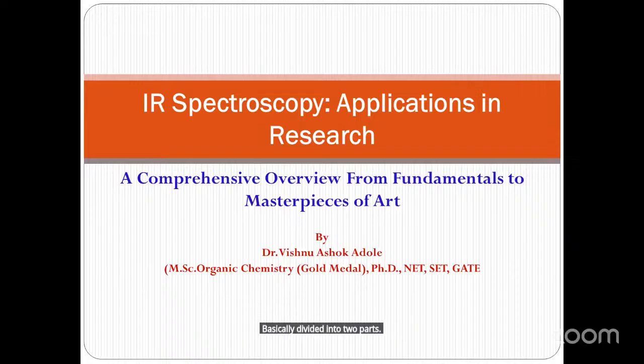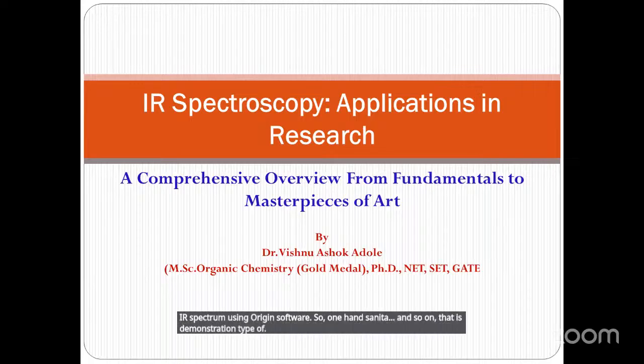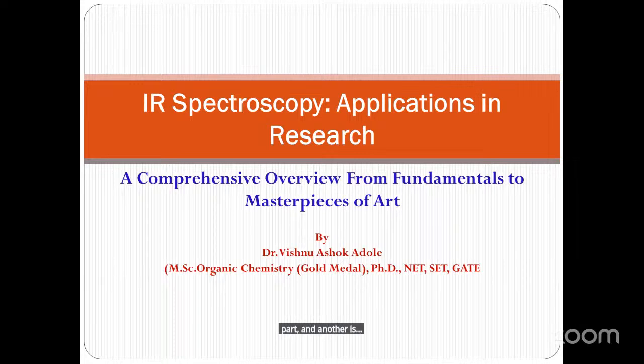One, I will discuss the theoretical part of IR spectroscopy, and second, how to plot an IR spectrum using Origin software. So one is a hands-on demonstration part, and another is a simple theoretical background, which is quite essential for research purposes.